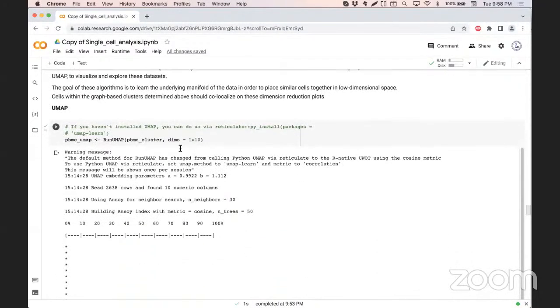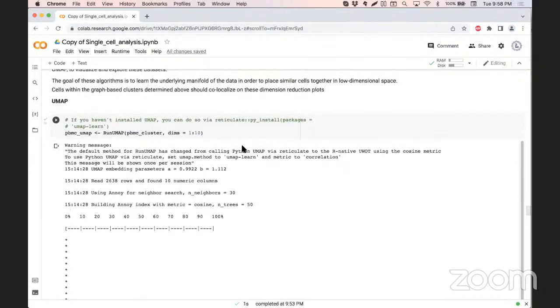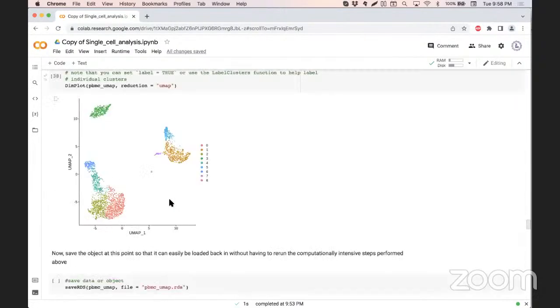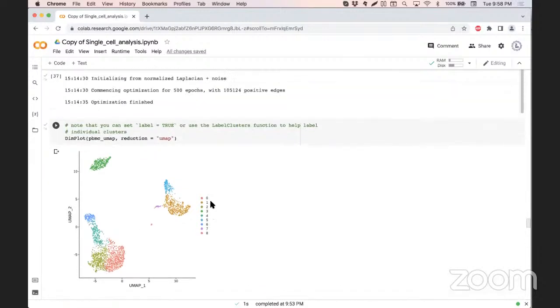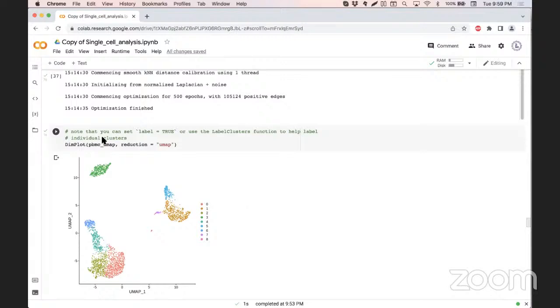So we can perform UMAP. We can run UMAP, and then we can try to identify the different clusters we have. So we have been looking for different clusters, and then we can straight away see the difference between a linear transformation technique like PCA and a non-linear transformation technique like UMAP. That will work much better for the data that we have.